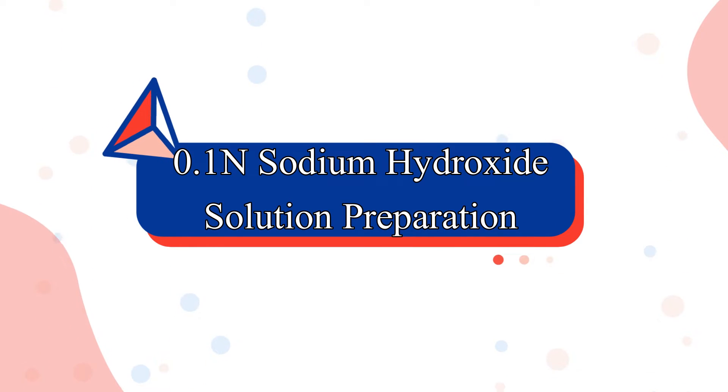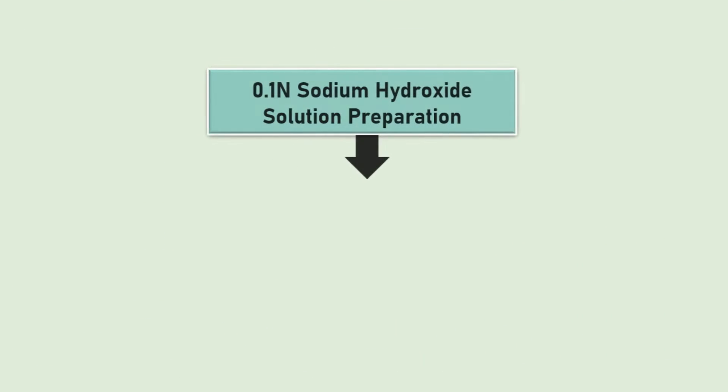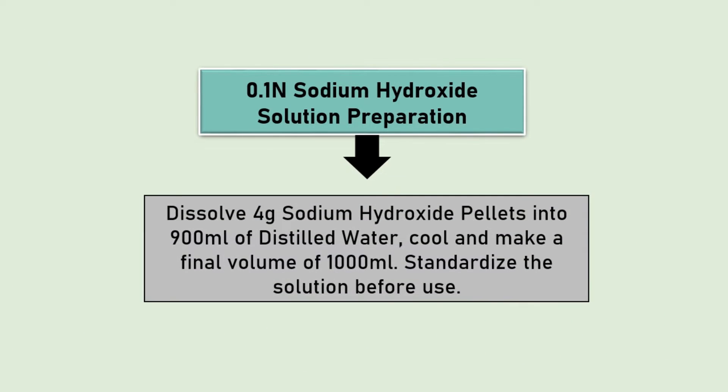At first we will prepare the chemicals. For the preparation of 0.1 normal sodium hydroxide, dissolve 4 grams of sodium hydroxide pellets with 900 ml distilled water and make the final volume of 1000 ml. Standardize the solution before use.